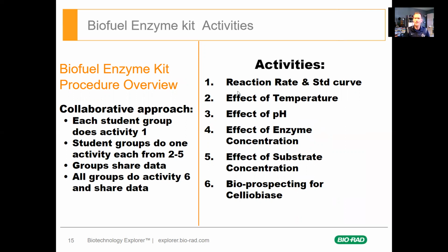Right. Then from there, the five of them are going to pick by changing temperature, changing pH, changing the concentration of enzyme, concentration of substrate. One of you is going to do the same thing as somebody else. We're going to run another experiment, and we're going to design how you're going to change the experiment. Then we're going to bring together all the lab data.